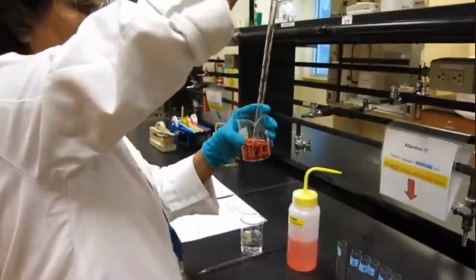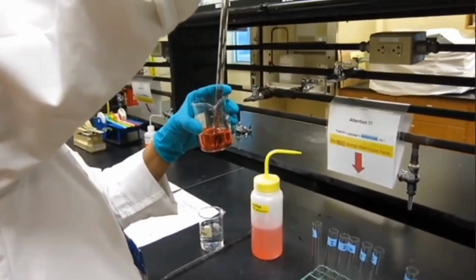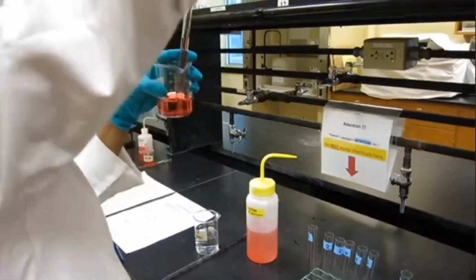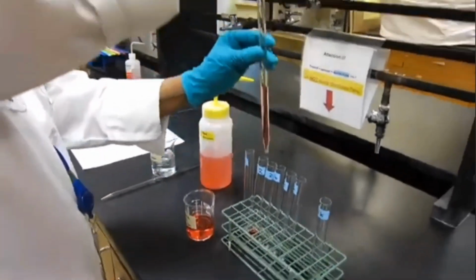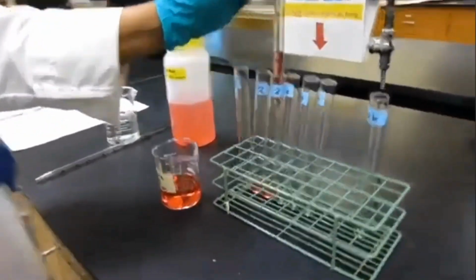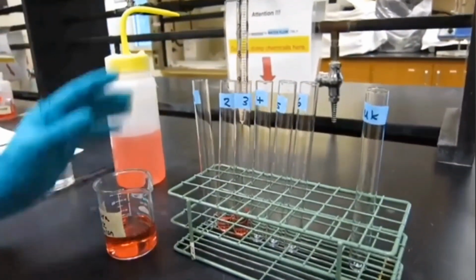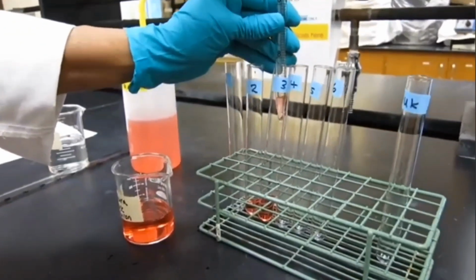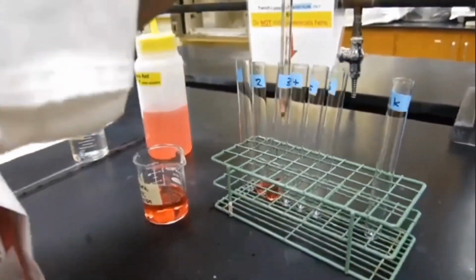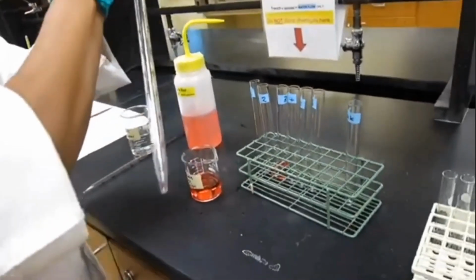And for the third test tube, we're going to be adding 4 milliliters of Allura red, and the fourth one 6 milliliters, fifth one 8 milliliters, and the sixth test tube will have 10 milliliters of Allura red stock solution. So it would be 0, 2, 4, 6, 8, 10. So that's what we are doing right now, and that's what you are seeing right now.